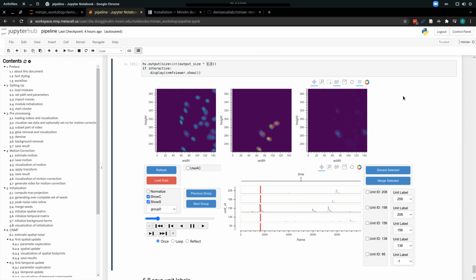No, I just wanted to know about the refresh button and also the load data button. They are not supposed to be pressed. Okay, that's a quick answer. Refresh is for when you have multiple datasets. Load data loads everything in memory, but that's barely working. Yeah, that's what I've been experiencing before. Thanks.